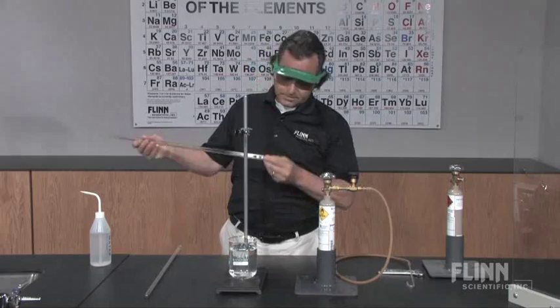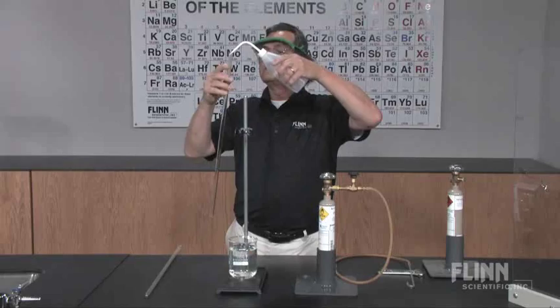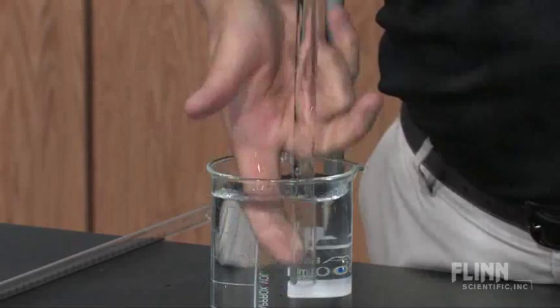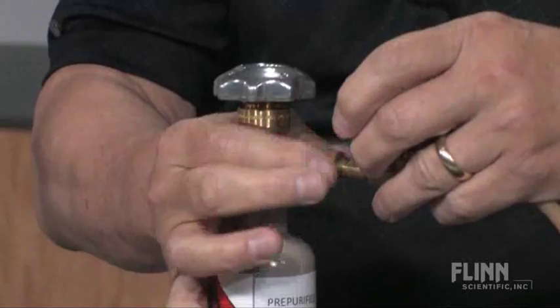First, check the tube for cracks, scratches, or other defects. Then, fill the tube completely with deionized water and place it in a water bath with the tube secured to a stand by a clamp.